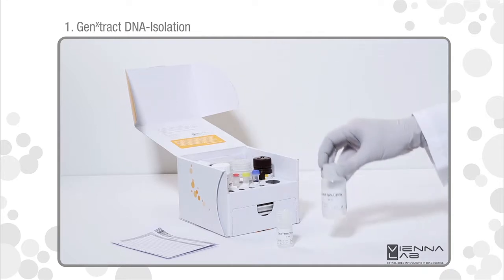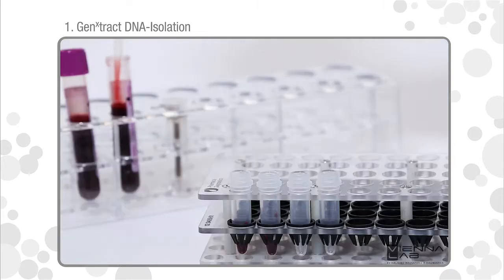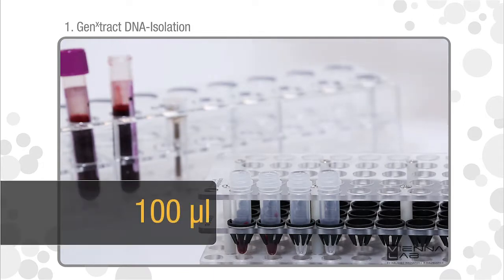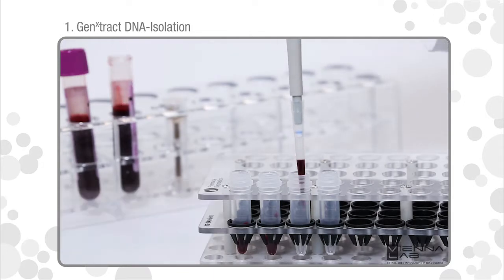Allow gene extract resin and lysis solution to reach room temperature. Pipet 100 microliters blood sample into a 1.5 milliliter microtube with screw cap.